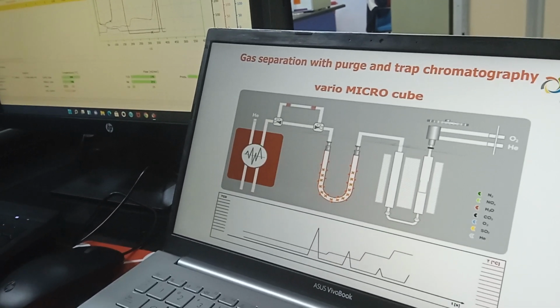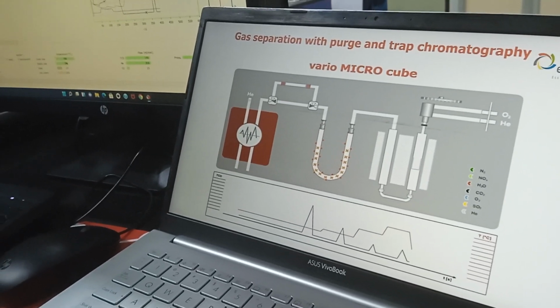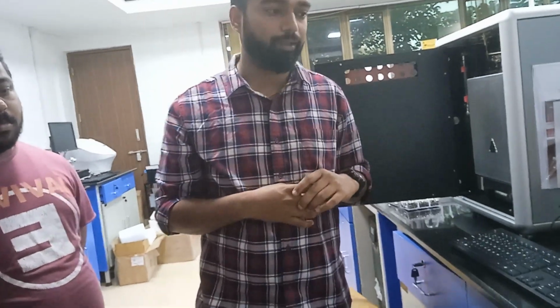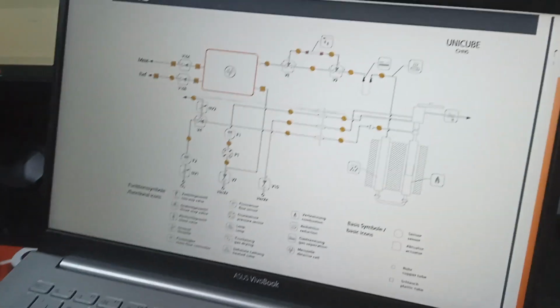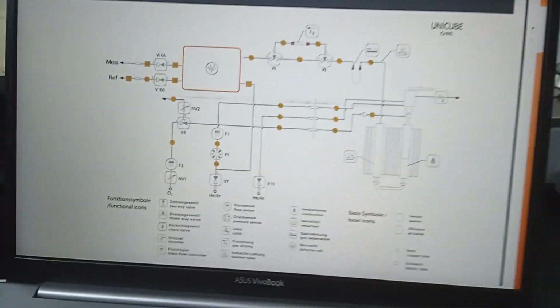A drying tube is filled with a color indicator, a wet absorber, we can say. When it absorbs the wetness of the sulfur, the color also will change, so it indicates you have to change it. First is nitrogen, then CO2, then hydrogen, then sulfur. Can you just give a quick explanation?